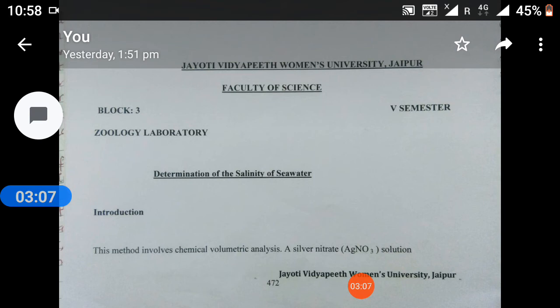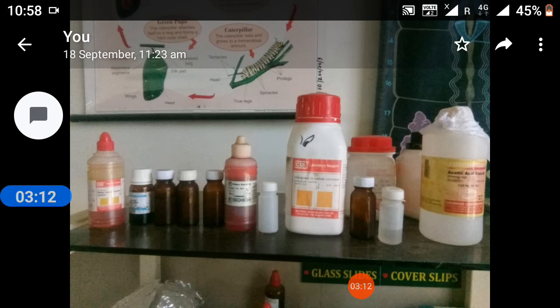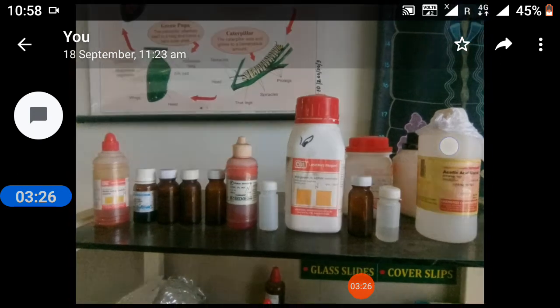A stirring rod left permanently in the flask, especially if a magnetic stirrer is not used, will help to break up the clots. The procedure to determine the chlorinity of a sample of seawater uses titration techniques. The reaction is different from an acid or base solution.